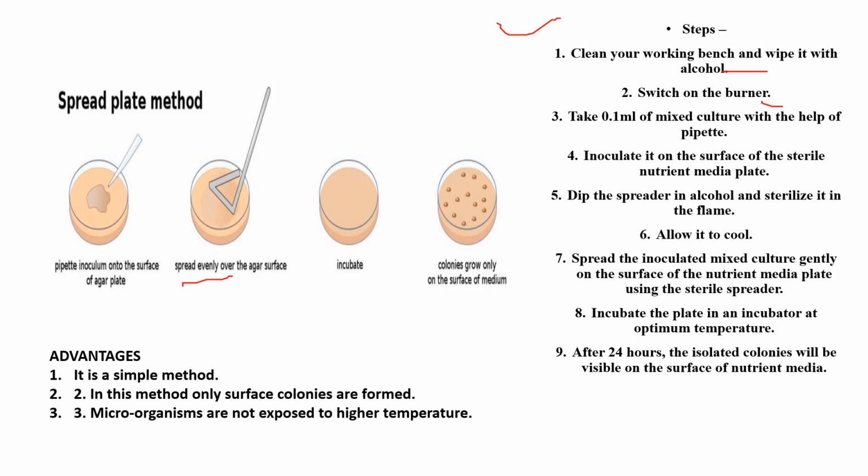So what are the advantages of spread plate technique? It is a simple method. In this method, only surface colonies are formed and microorganisms are not exposed to higher temperature. And what are the disadvantages of this method?